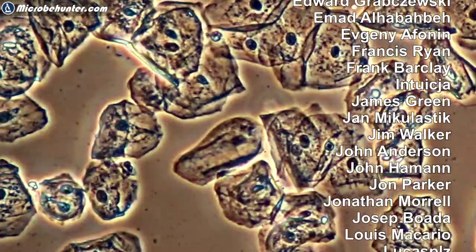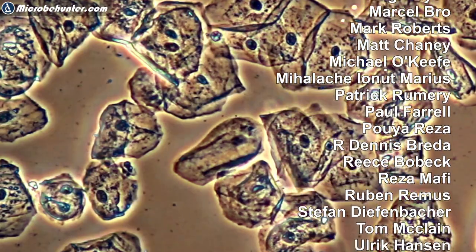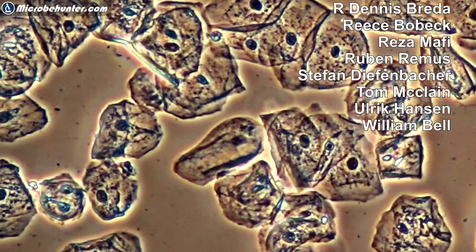And it does look nice. I mean, for the sake of a YouTube channel, that's also one of the important things that the objects that you look at look a little bit impressive and nice.